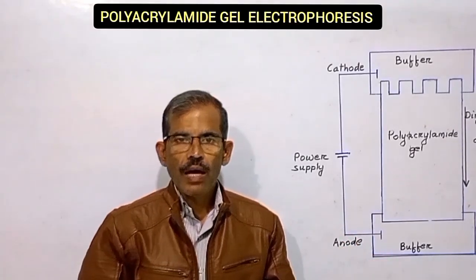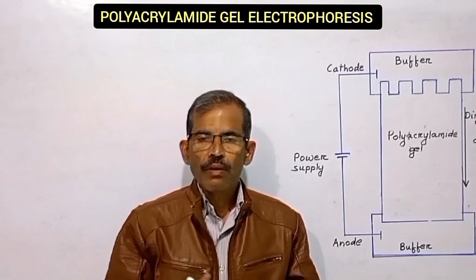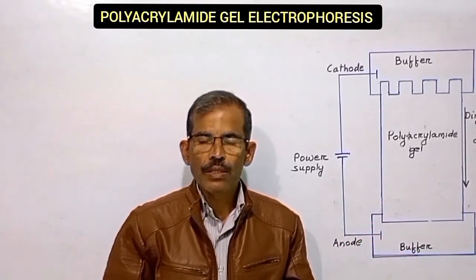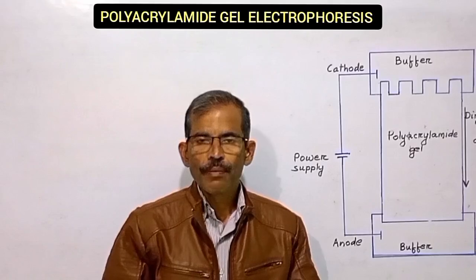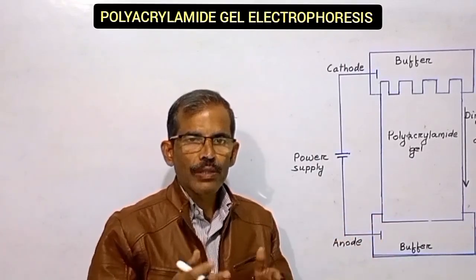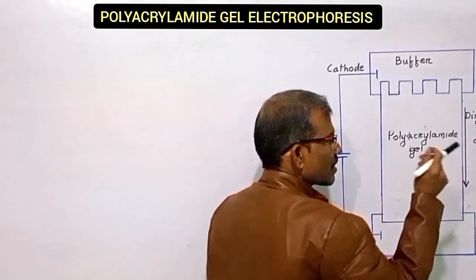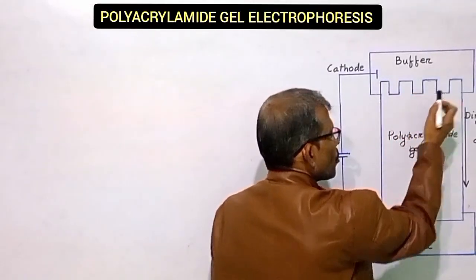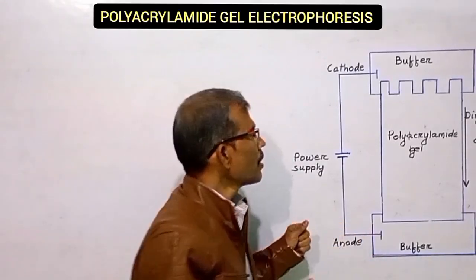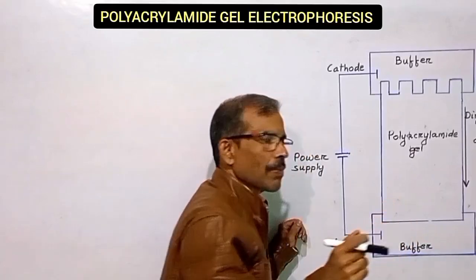The tracking dye, which moves at the fastest velocity, facilitates the determination of the extent of electrophoresis. On the other hand, the dense compound ensures that the sample components settle at the bottom of the well. This minimizes sample diffusion in the buffer solution placed in the upper chamber.